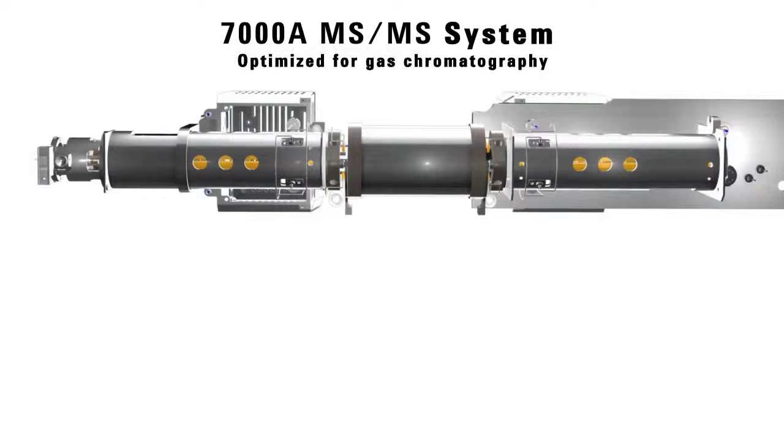The 7000A MS-MS, an MS-MS system optimized for gas chromatography.